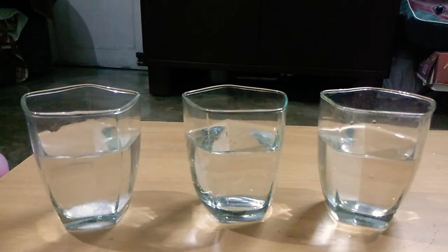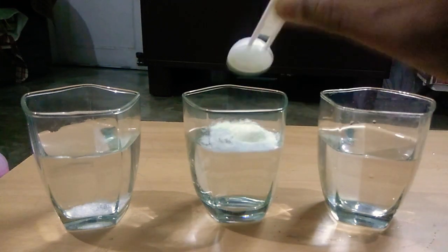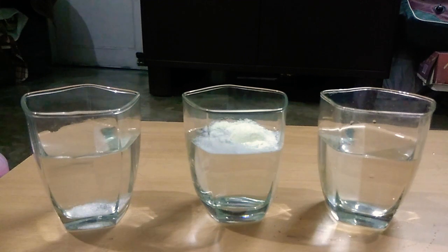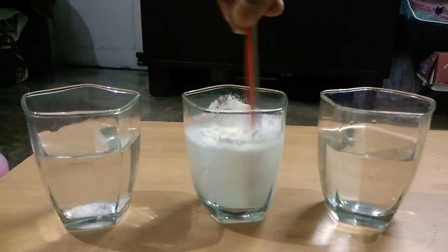And in the other glass we take some powdered milk. I have taken powdered milk and I have put it here. Stir it and mix it out.